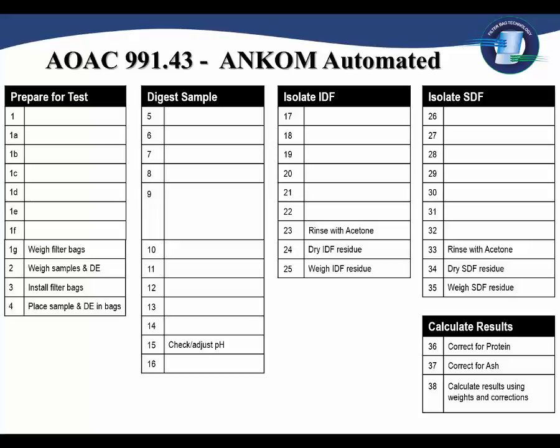You don't have to manipulate the samples. Most of our samples, or maybe I should say most of your samples, are going to filter in less than 5 minutes. There have been exceptions. Psyllium husk, which cannot be filtered in the conventional method, has a modification that can be done for the conventional method using a centrifuge. That will take 20 minutes for us to do a TDF. It'll take us 20 minutes to do that filtration after precipitation. But that's the extreme example.